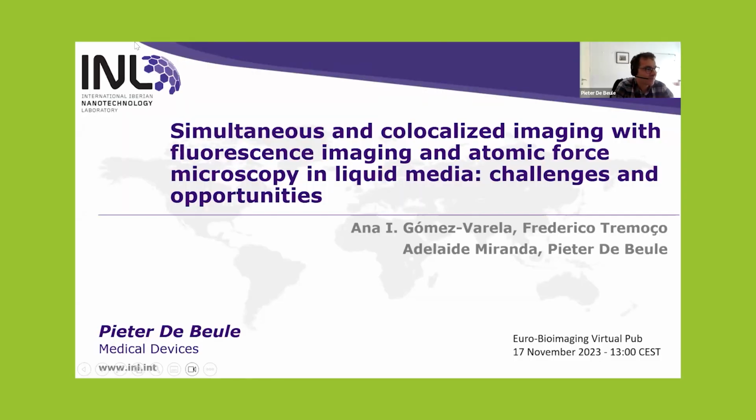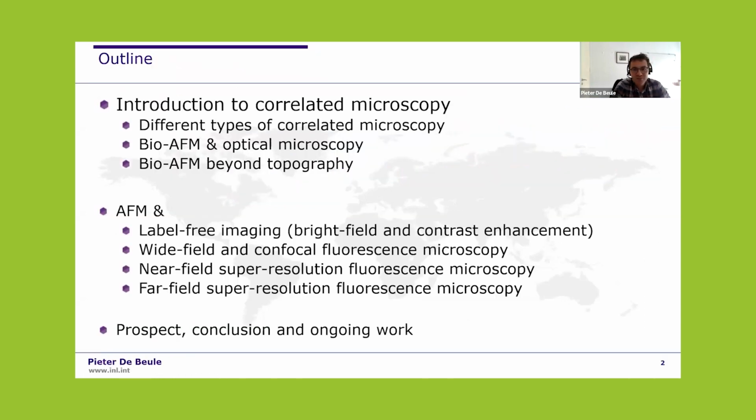Once again, welcome all to this presentation, and I would like to thank Johanna for extending me the invitation for giving a talk today to put our work a little bit within the context of Euro-BioImaging. So I will be talking to you today about correlated microscopy, and in specific correlated microscopy for combining atomic force microscopy for biological purposes with optical microscopy as a whole, and in particular at the end of the talk I will focus on some of the developments in combining atomic force microscopy with super resolution fluorescence microscopy.